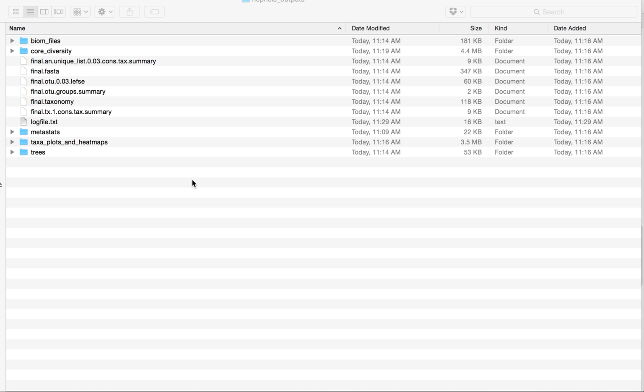In this video, I will show you how to interpret the results from your mothur paired end run on Nephele. After receiving the pipeline completed email, simply click on the link and download the pipeline results folder. This is a zipped file which can be unzipped by double-clicking it on most standard computer operating systems.